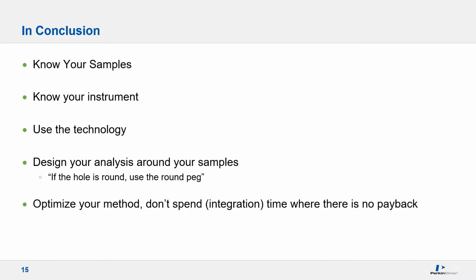So, in conclusion, know your samples, know your instrument, use the technology, and then design your analysis around your samples. If the hole is round, use the round peg. Then optimize your method. Don't spend time where there is no payback, particularly integration time.